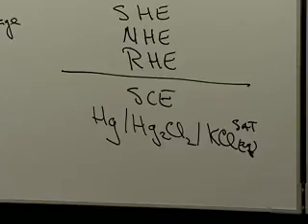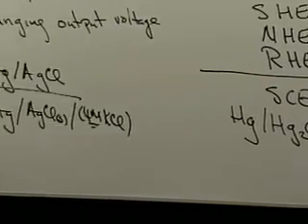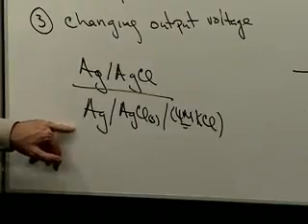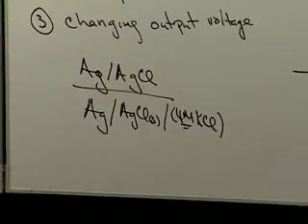So when you go and buy one of those fancy combination pH electrodes that measures the pH for you and has a built-in reference electrode, typically it's this material, because sometimes you like to measure pH at weird temperatures, and the SCE would be a little problematic there. Okay. Exactly the same idea.